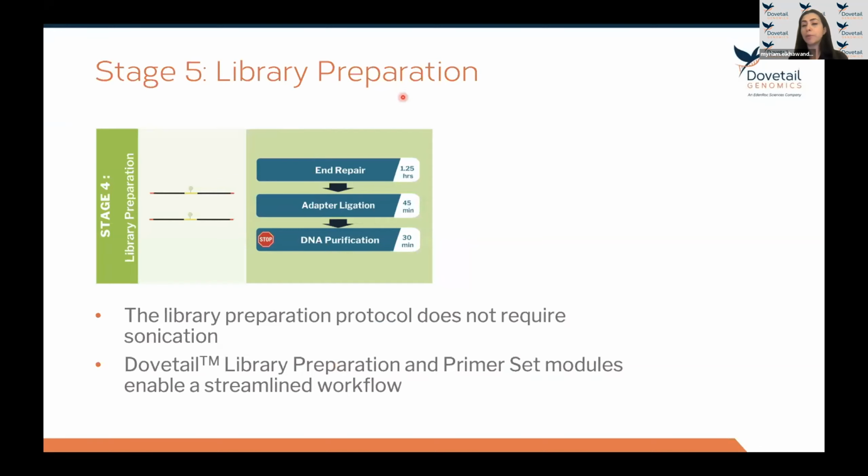Stage 5 is library preparation. As I mentioned, there is no sonication step prior to library preparation, so you will directly proceed to library preparation. These steps are standard for any NGS library prep. So you'll first repair the ends, add the adapter, and purify the adapter ligated DNA.